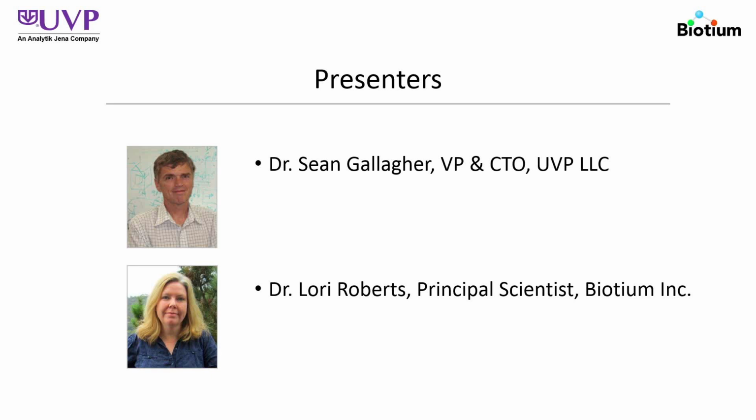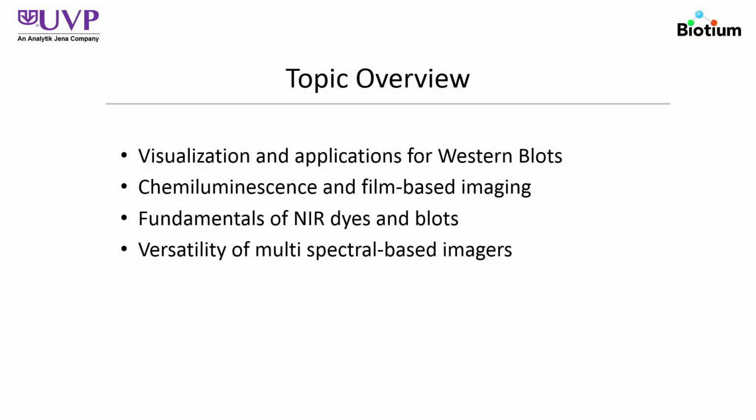Well, thank you, Mike. It's a pleasure to be here. For today's presentation, I'll be covering a range of overview topics specifically around the visualization and applications of protein or Western blots. In addition, I'll spend some time comparing both CCD and film-based imaging techniques for Western blotting using chemiluminescence. Researchers still use film due to historical reasons.